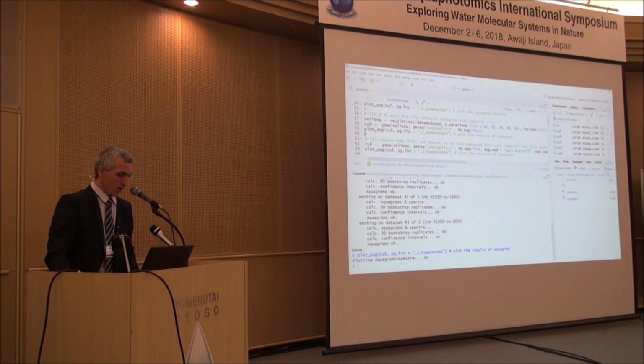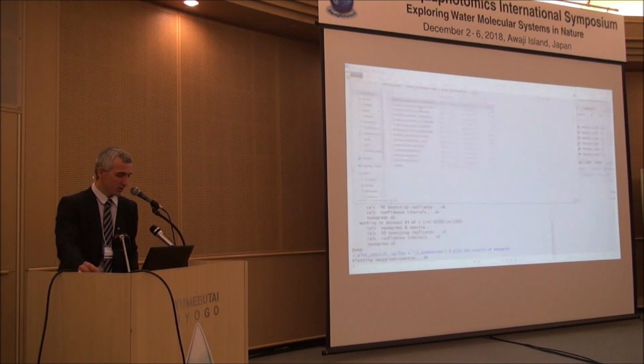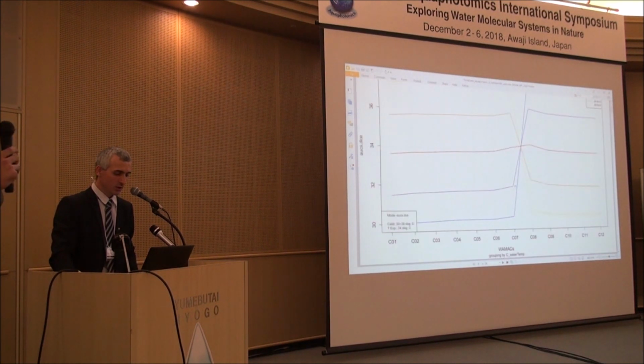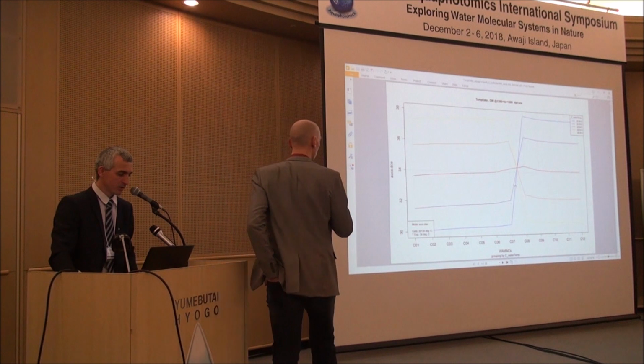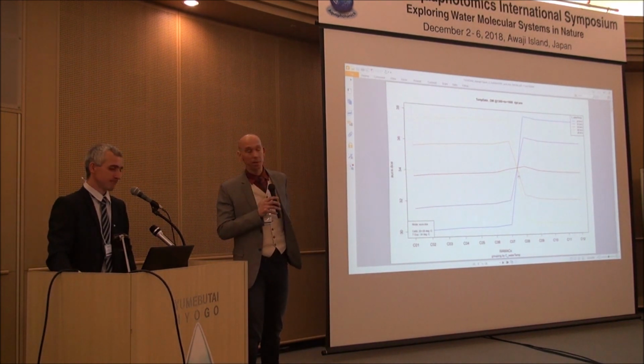So once you are through these three lines, then again you must see a new PDF file in the results folder which contains the graphs for this new type of aquagram, which is a linearized version of the previous one. Go to the next one, next slide.